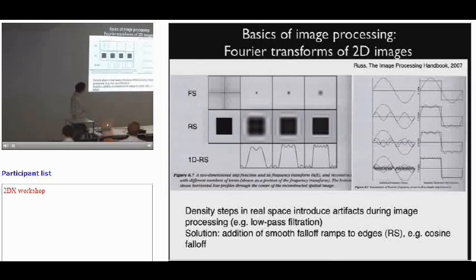And I think this can all be easily understood if you think about the whole bunch of different cosine functions that will actually make this rectangle. If you exclude the higher resolution ones, you will not be able to describe such a hard edge very accurately.